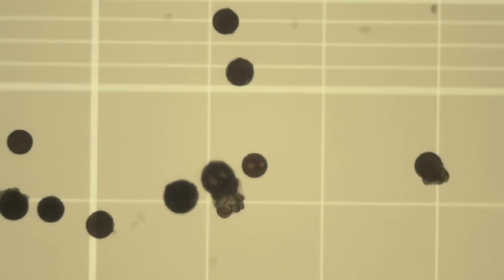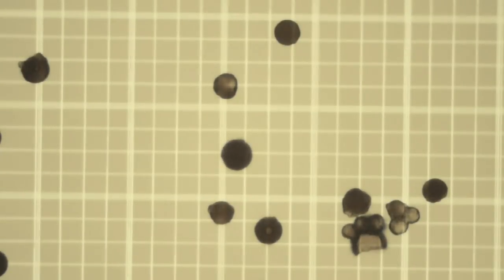And finally we want to come up to the center. And to do that, I'm going to go back up to the 4 power so that I know where I'm at. Okay, there's upper left, there's upper right. Right here is our center chamber. It's 16 squares, which are each subdivided. And so now let's drill down and focus.